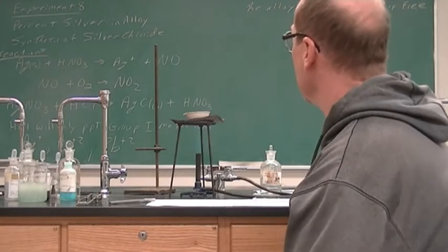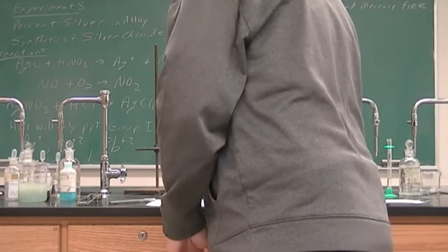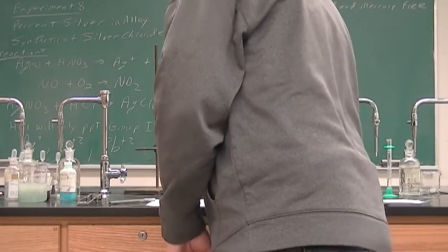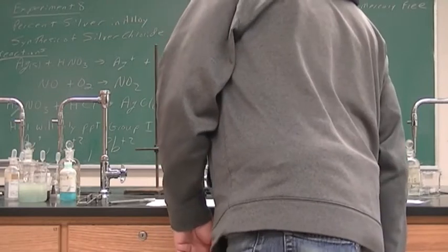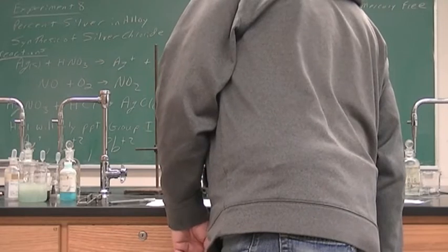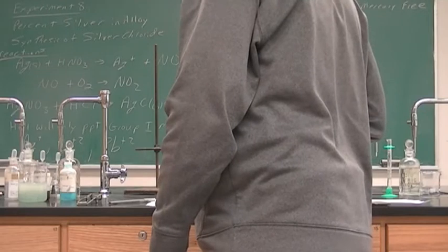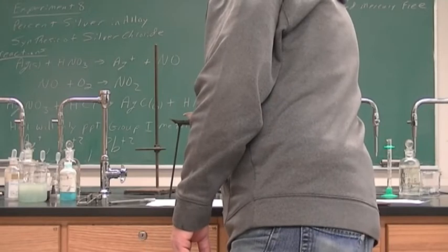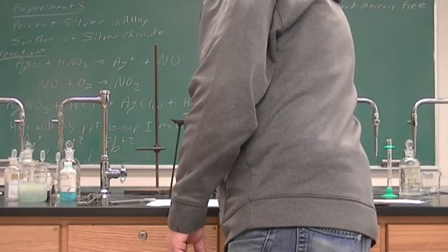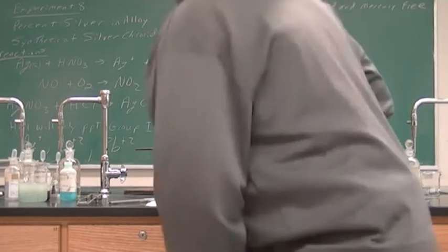It's going to take, I don't know, hopefully not too much longer. I keep cranking it up more and more.